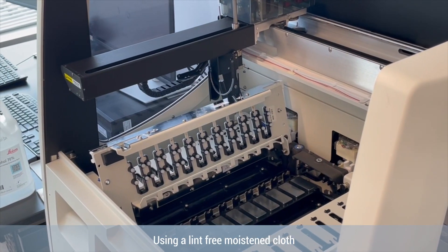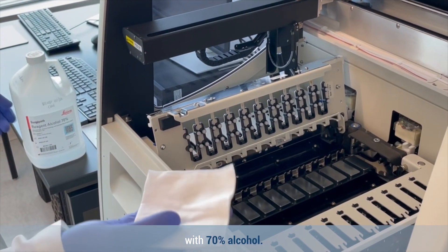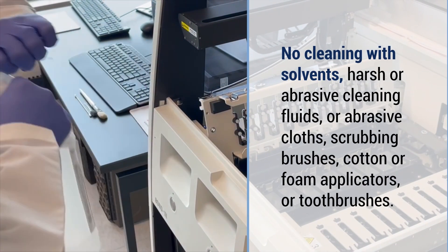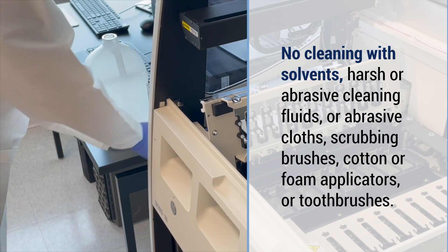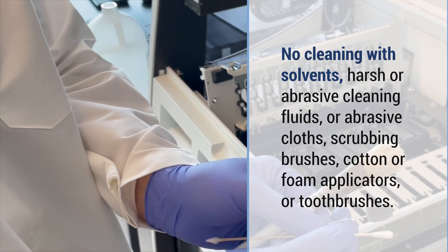Use a lint-free cloth moistened with 70% alcohol. Do not clean with solvents, harsh or abrasive cleaning fluids, abrasive cloths, scrubbing brushes, cotton or foam applicators, or toothbrushes.